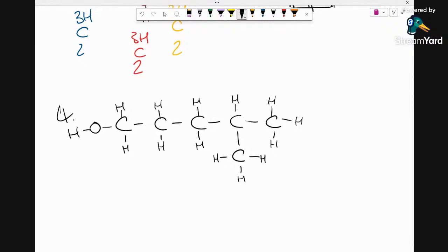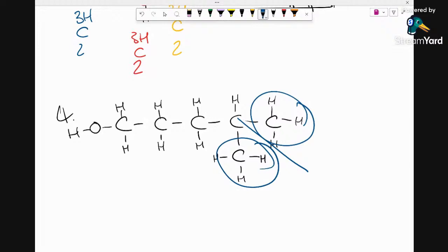What's interesting is there's no molecular symmetry line here. I can't do that. But there is a partial symmetry line here. These two are the same. So at that point, because there's no other symmetries, I can simply count my environments as 1, 2, 3, 4, and then 5. These two are the same. So I'm going to have 5 things, purely because if there's no symmetry at all, you max out at your max number of carbons. But if there's symmetry, you can then reduce the number.